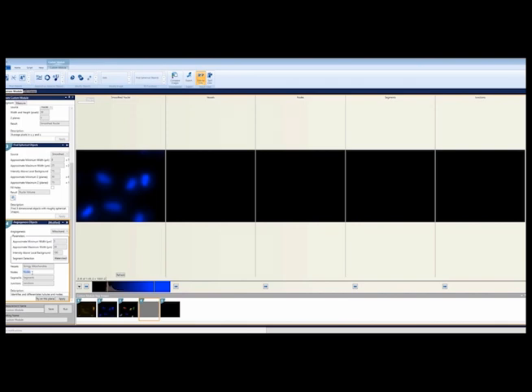For this module, we will use angiogenesis objects. Angiogenesis is a good tool for finding tubes, which is great for the healthy mitochondria. But it also attracts nodes, which makes for a great mask detecting unhealthy, clumpy mitochondria.